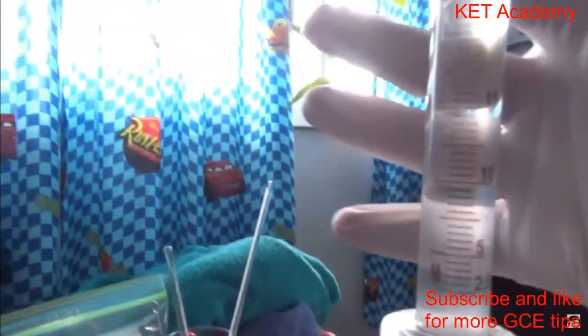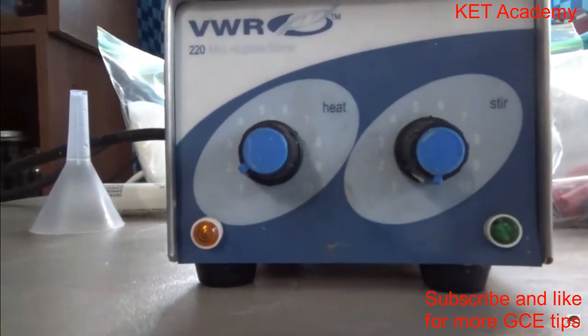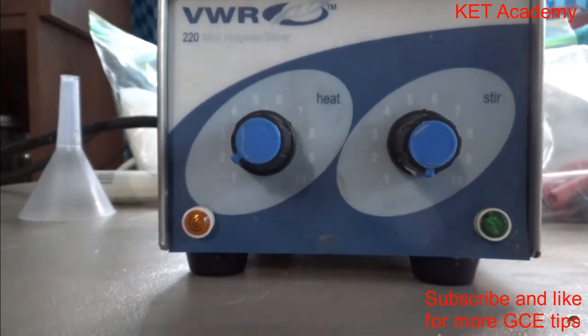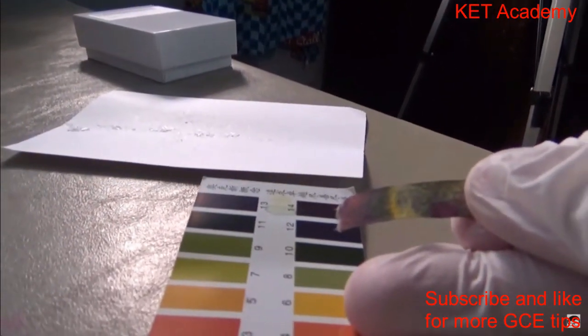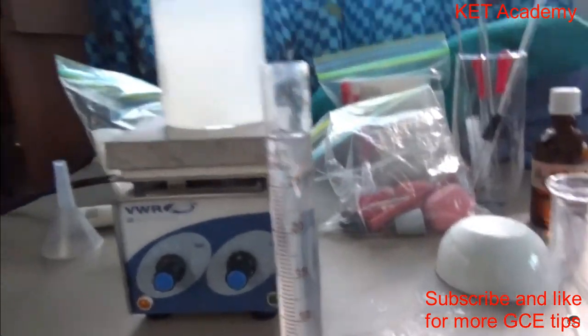I can actually save this for later, but I got this, which at least should contain calcium hydroxide. And to make sure, I can do a quick pH test. I believe it should be about 12. The pH should be. So there you go. There's that, and it should be about 12.4, I think. And that is between 12 and 13. So, yep, we do have the solution all ready to go.